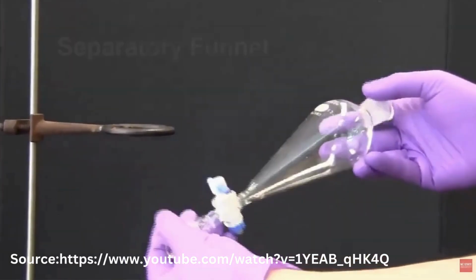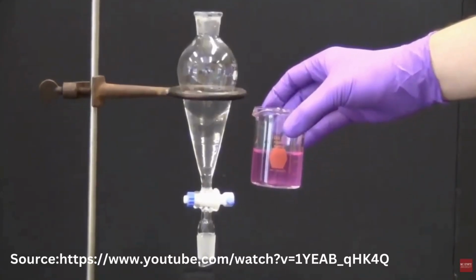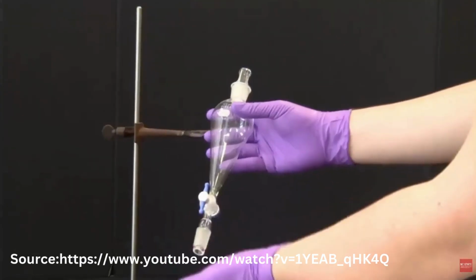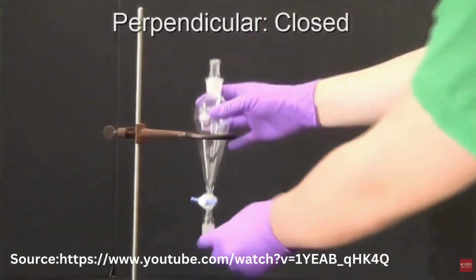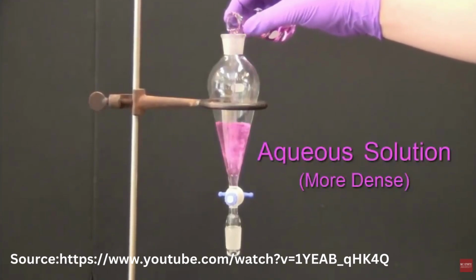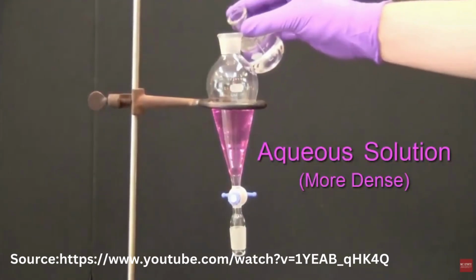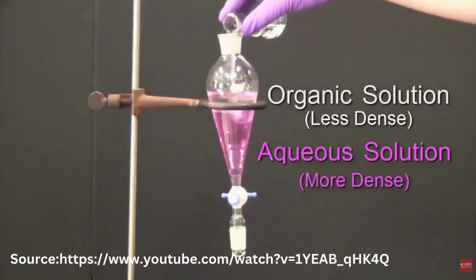For the demonstration part, the apparatus used is a separatory funnel. The chemicals used are an aqueous solution and an organic solution. Firstly, make sure to close the valve and then attach it to the retort stand. Then pour the aqueous solution first, which is the more dense liquid, followed by the organic solution, which is the less dense liquid.